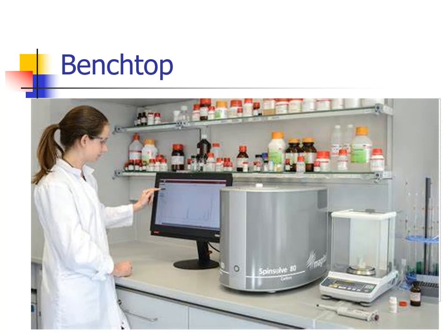This instrument, just like the other instrument, needs a sample, and the sample entry ports are typically lowered from the top or some type of door that will open up. So we're going to eventually put these organic compounds into an NMR. We're going to close the door, seal it off, and then we're going to allow the NMR to do what the NMR needs to do. So I think it's very important for you to take a look at these pictures of NMR instruments. What is actually doing the measuring, what's doing the analytical parts of the NMR for us, and I think these pictures get that point across, hopefully.